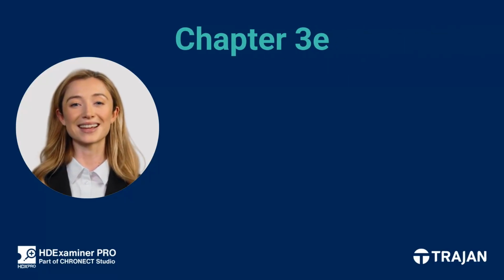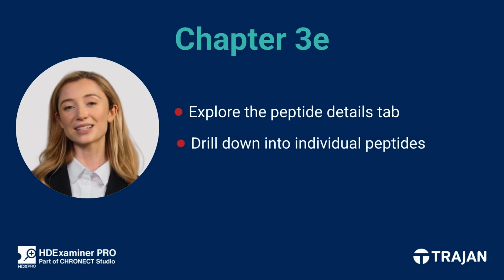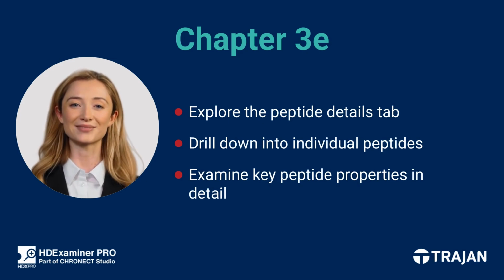Welcome to Chapter 3E. In this segment, we'll explore the Peptide Details tab, where you can drill down into individual peptides, view supporting MS2 and DIA data, and examine key peptide properties in detail. Let's get started.